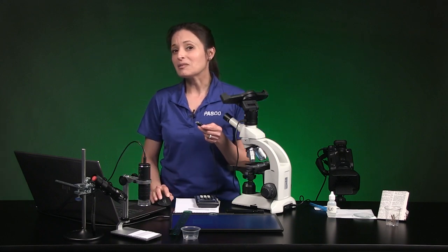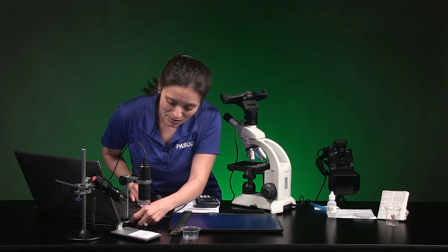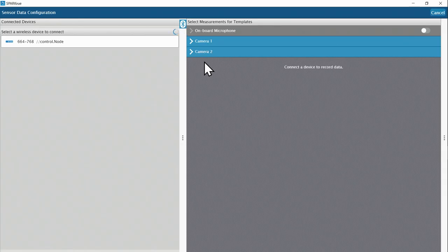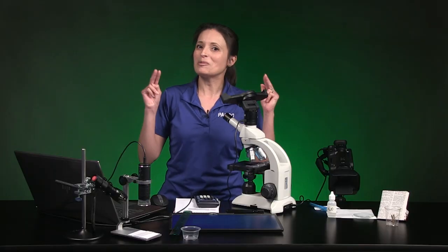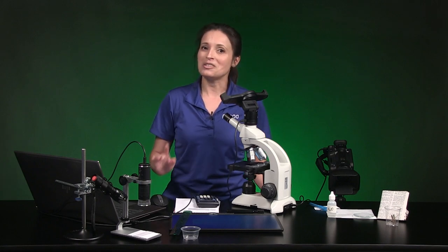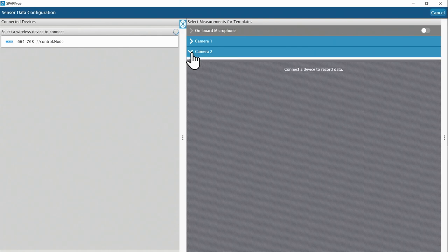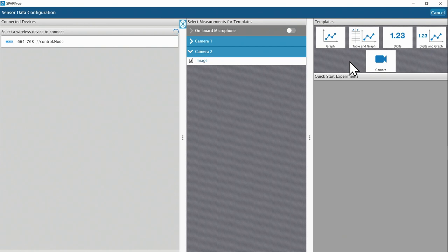While I'm looking at this screen, I can plug in the USB cable. Now I can see a new camera join the list. Camera two is probably the microscope — I say probably because it's possible for SparkView to change camera numbers, and later I'll show you what to do if that happens. So now I need to open the camera two menu and add a check mark to the image checkbox to get access to the video feed. Notice how once that box was checked, a camera option appeared in the templates menu.